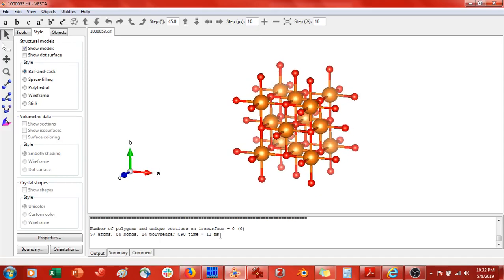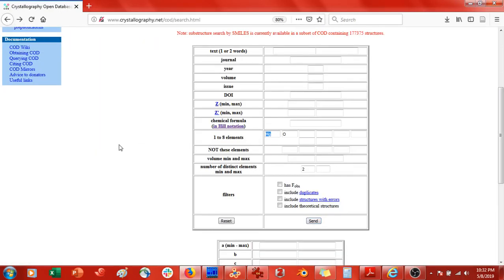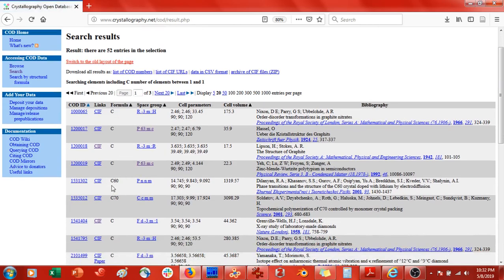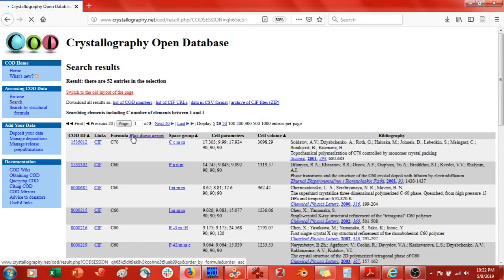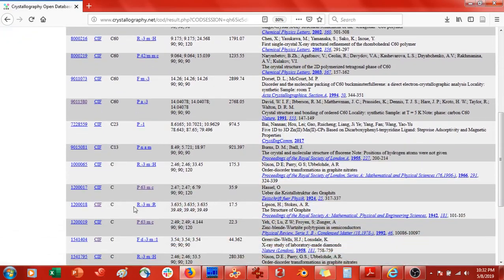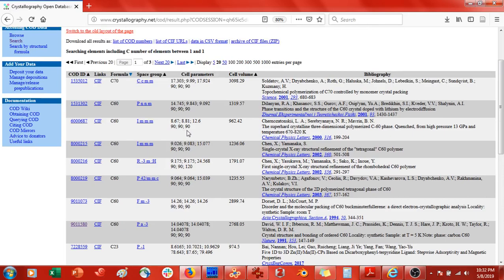So let's do this for carbon-60. I'll go back and type in carbon, deleting the other elements, since carbon-60 only contains carbon. The number of distinct elements is one. Press Send. Here's carbon-60. We want to sort this by formula, because I don't think this is necessarily the carbon-60 we want — we want crystalline C60. Here are all the different types of carbon-60 entries.